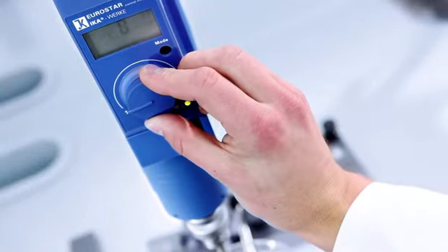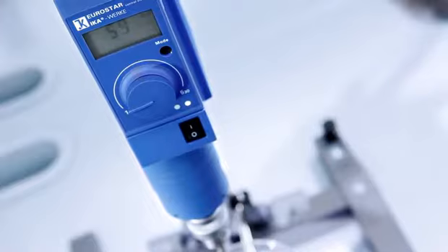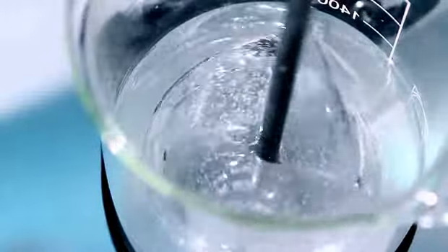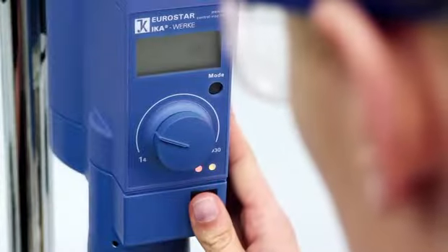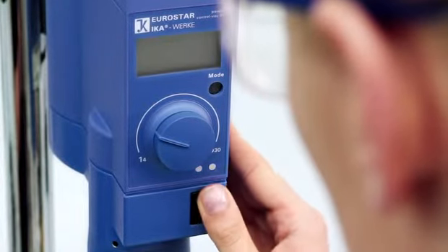Digital display of set versus actual speeds. High torque overhead stirrer, suitable for low to high viscosity tasks. Advanced overload protection.